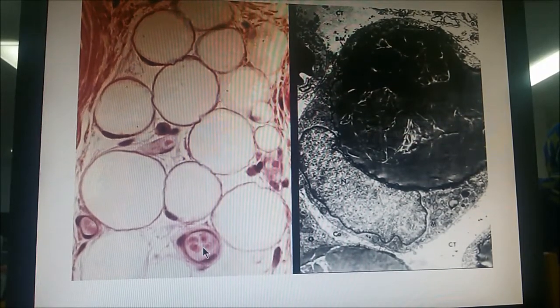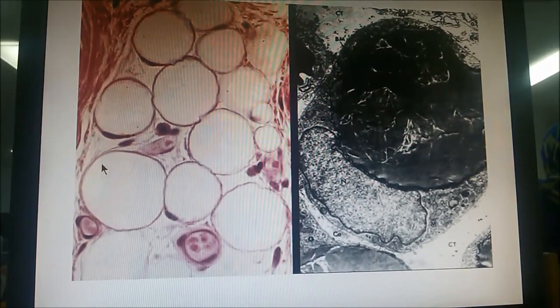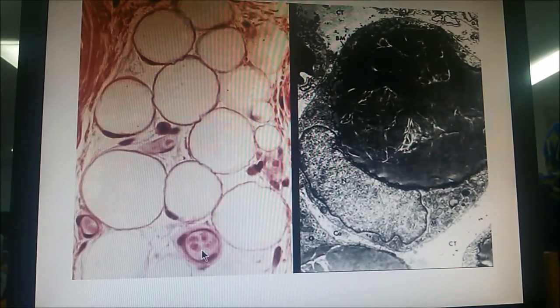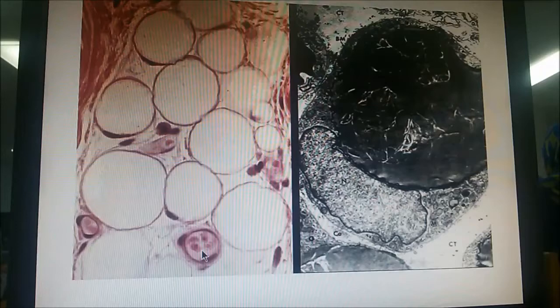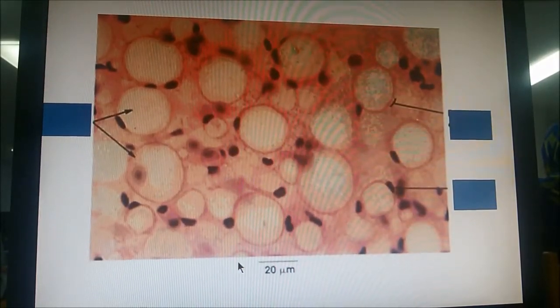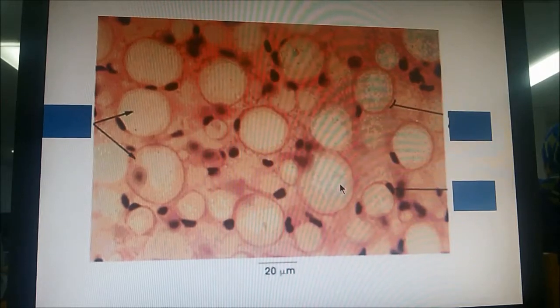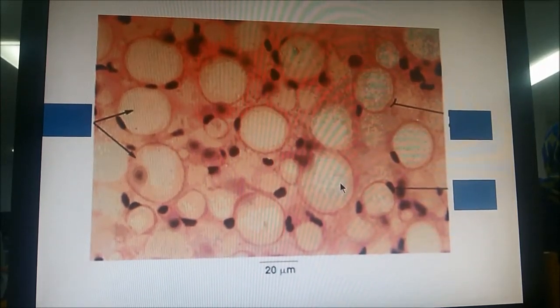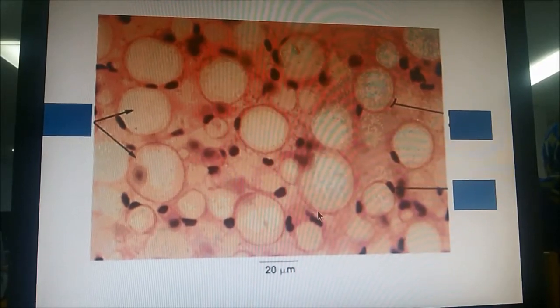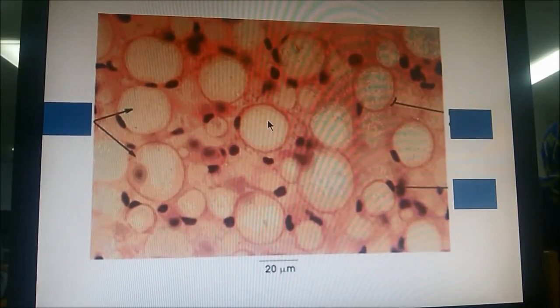Right. So it is richly vascularized, mainly located in the subcutaneous tissue. Of course, you took it in theory and in biology, that the fat distribution in the human body, in the superficial fascia, differs between males and females. In females it is concentrated in the breast and the buttocks area, the gluteal region. Here, what is the adipose signet ring appearance? White or brown? White adipose.